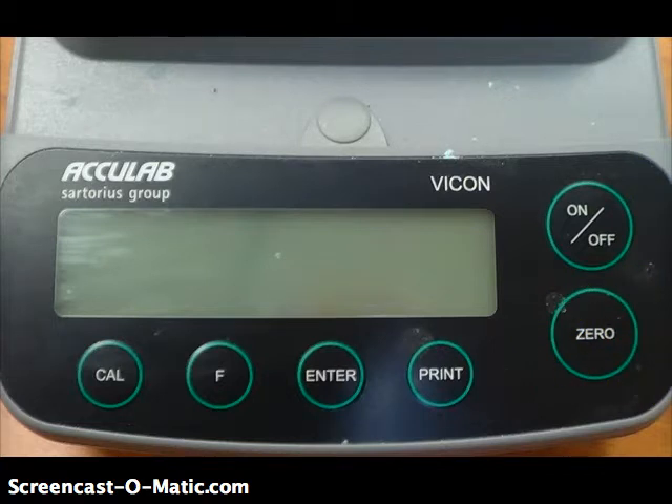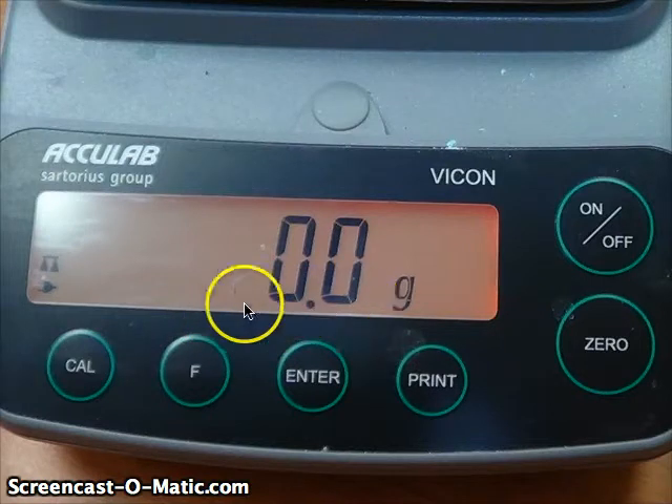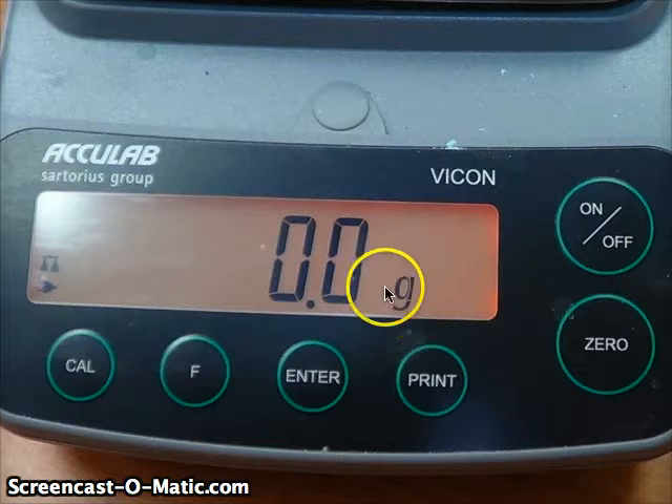Press the on button, turn the machine on, and you'll see some text displayed in the window. You want to wait until you see all zeros before you put anything on the tray. Never put anything on the tray before you've started up the balance and it reads all zeros. Also notice this G, which stands for grams — that tells us what units we're measuring in.